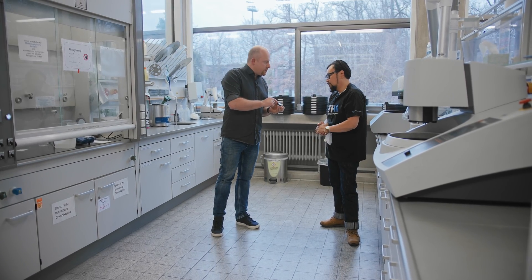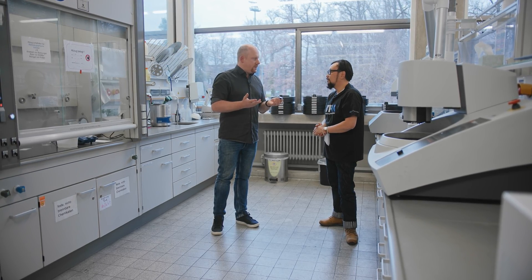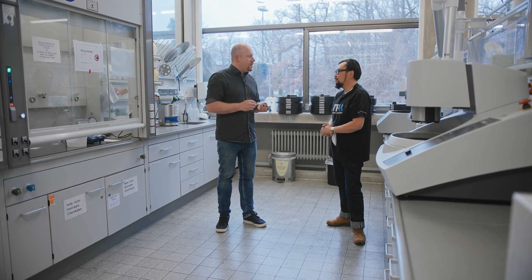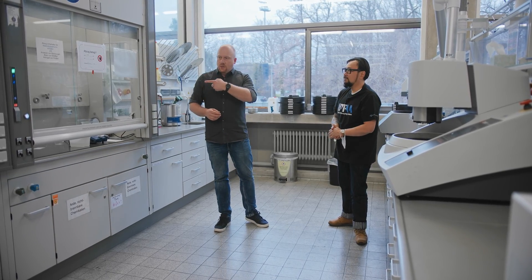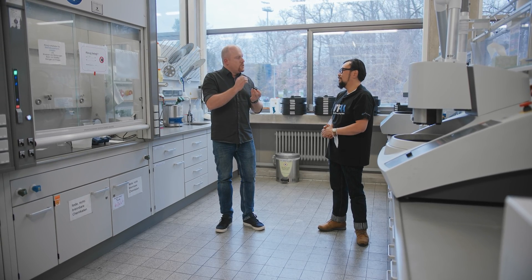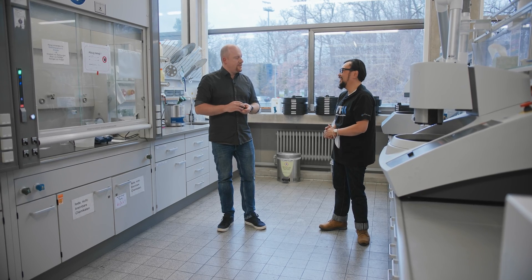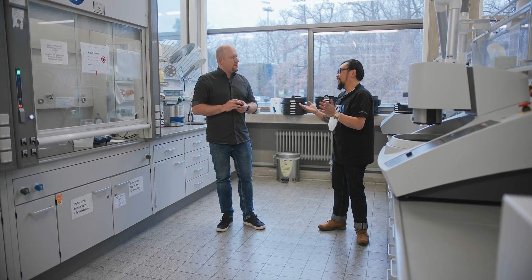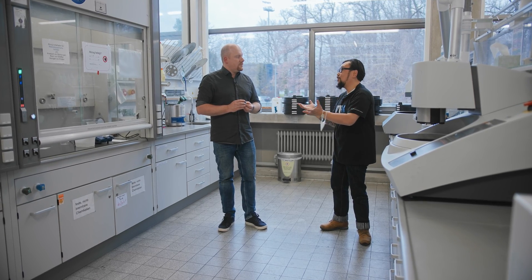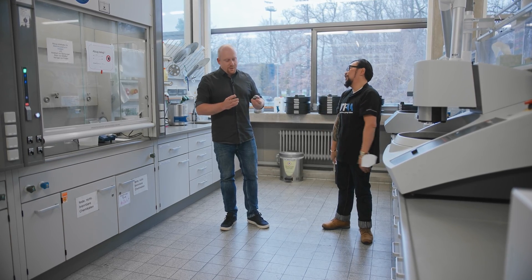What we have here is a steel sample — you can see the mirror finish. Under the light microscope you will basically see nothing unless you have some oxides or sulfide inclusions. You have to etch it. This is done here in these fume hoods, where you selectively remove phases and material to get good contrast in the light microscope. So basically, because you're obviously a materials research facility, you know what it takes to prepare a sample for observation.